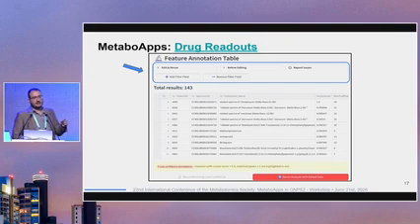The core is ideally the same, but you have, for example, a hydroxylation or a methyl group instead of an ethyl group and things like that.